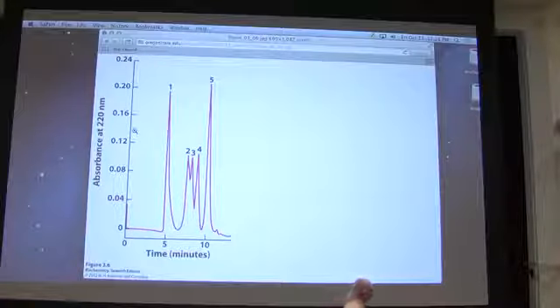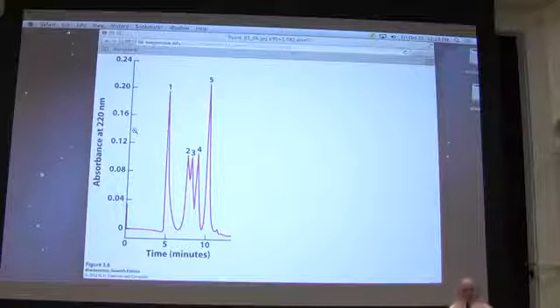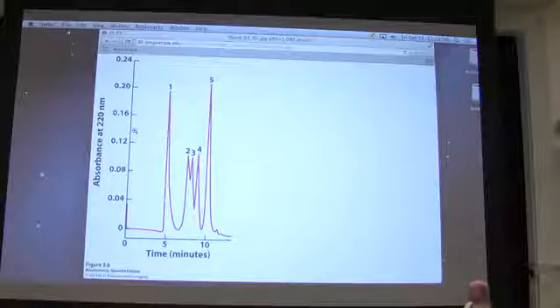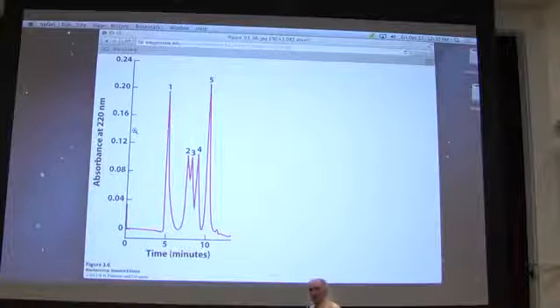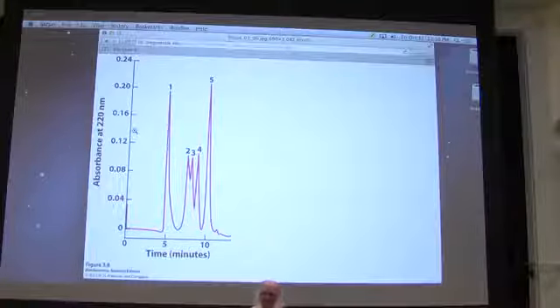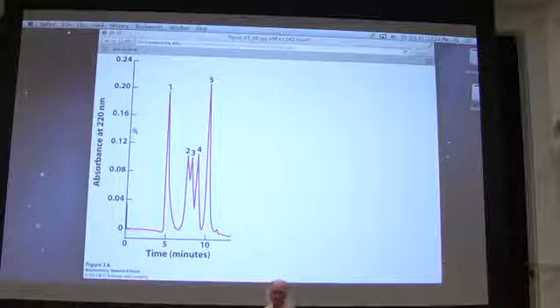The first things that come off in an HPLC column are those that are the most polar. Something coming off at 5 minutes, number 1, is the most polar molecule that's in that mixture. Things that are coming off at 11 minutes over here, number 5, would be the least polar, and these in the middle will be somewhere in between in terms of polarity. Yes? This can be used to separate a wide variety of small molecules, including carbohydrates, including lipids, and so forth.